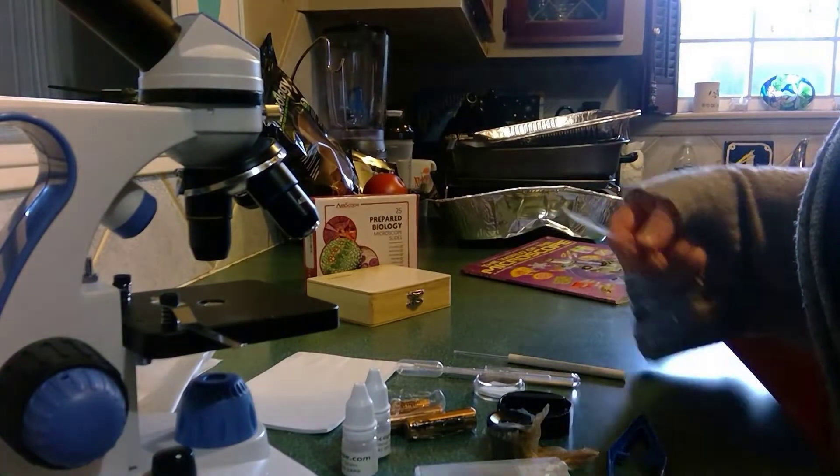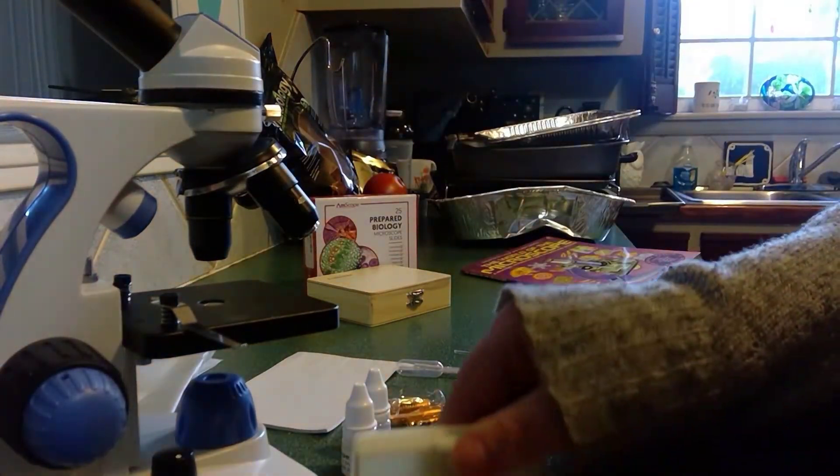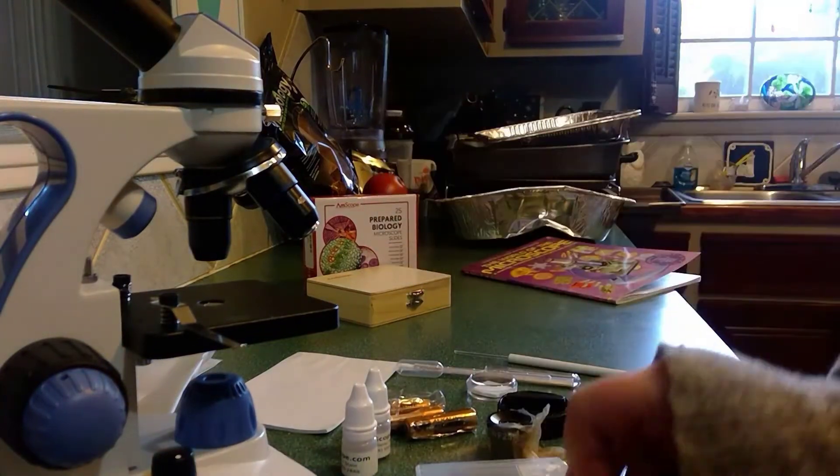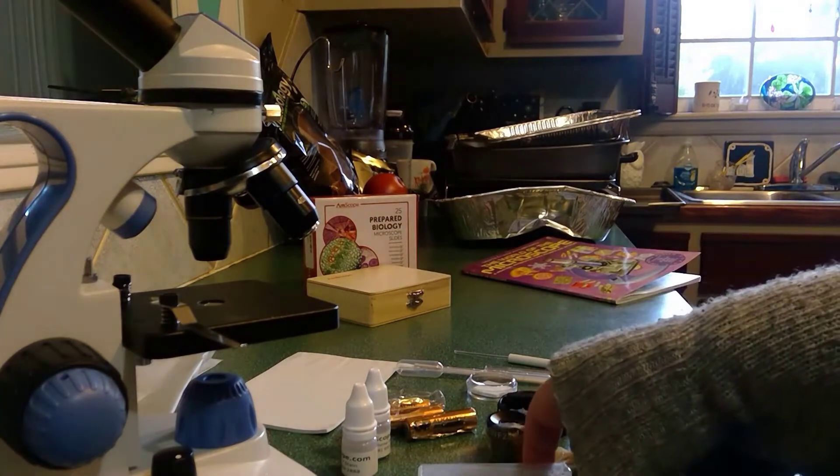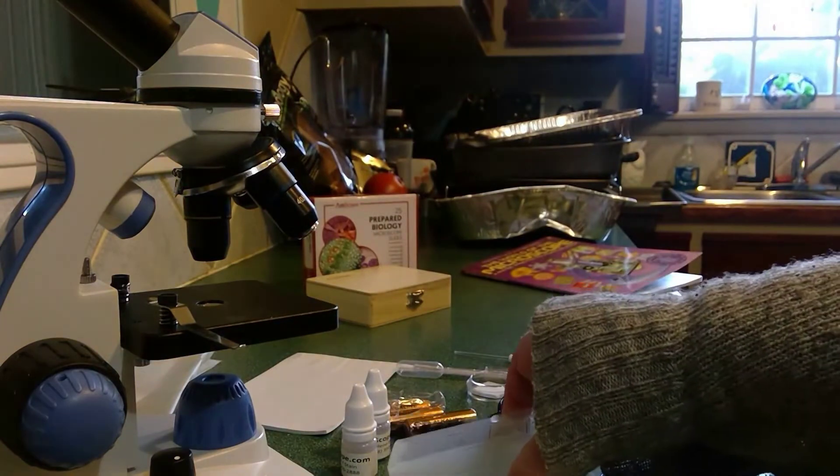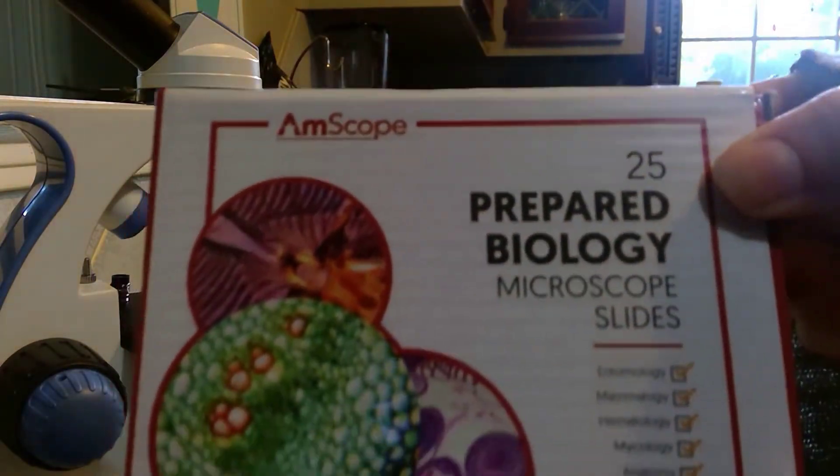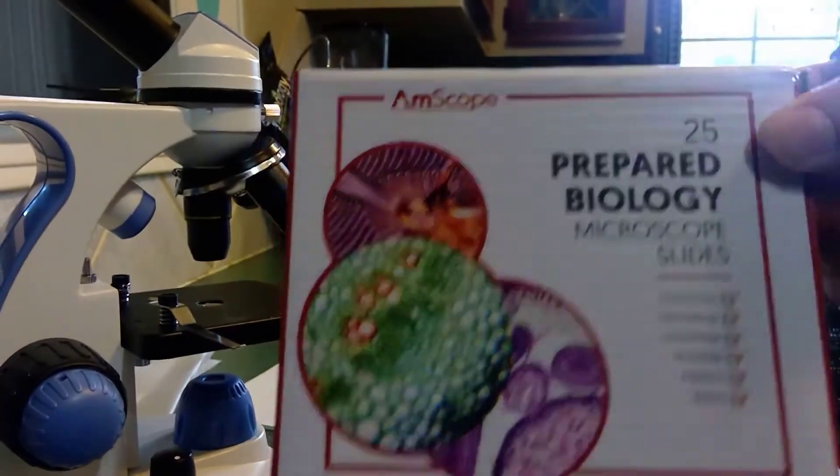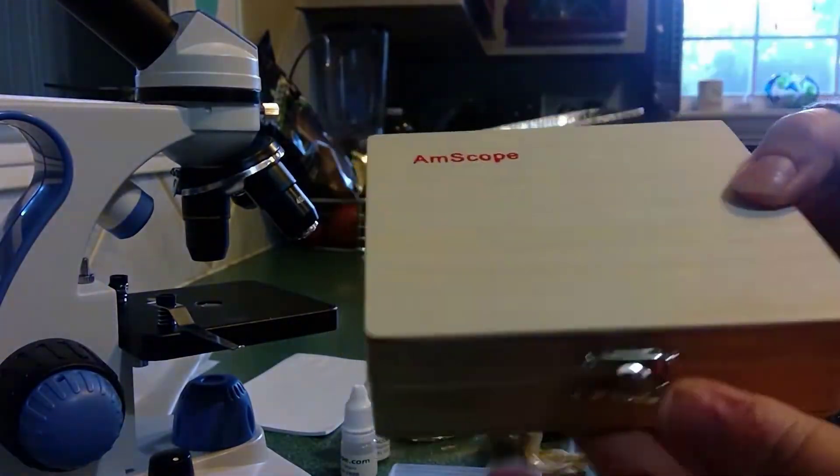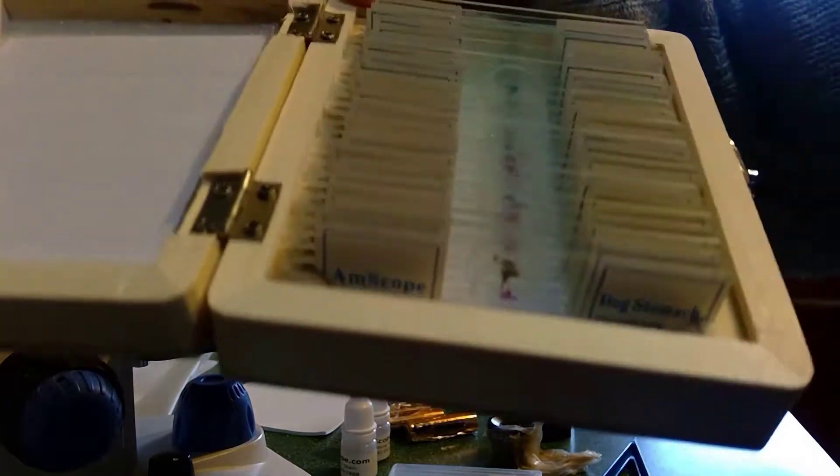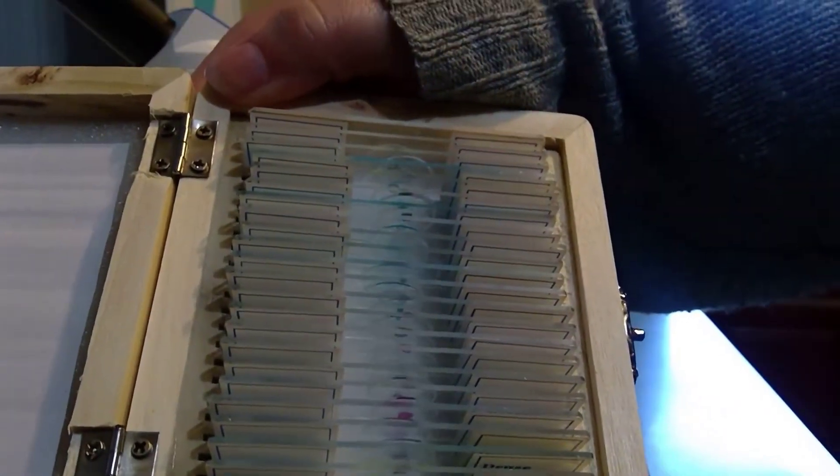I showed you these prepared slides and it does have blank slides so that you can make your own. And I can't remember if these ones are the ones that came with it because I mixed everything together, or if these are the ones that came with the set. But you'd have to take a look at the site if you're interested. But I bought these ones separately. They're 25 prepared biology microscope slides. And this is also from Amscope, and it comes in a really nice wooden box. And it's just got tons of prepared slides in it. And the girls will have a lot of fun taking a look at this stuff.